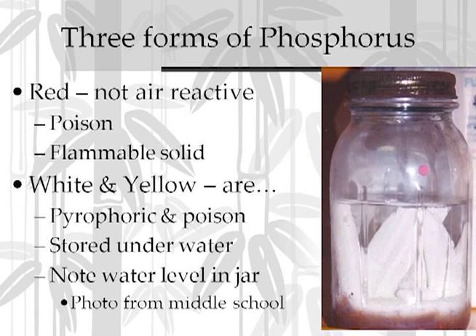We've already talked about metallic sodium and lithium and potassium, which are water reactives. Those are about the only truly water reactive compounds that we would recommend even considering having in the lab. Anything else, the risk posed by having these things is really not as good as the benefits from teaching with them. So if you're going to have a water reactive, have the lithium, small pieces of sodium, and why don't we just call it there.